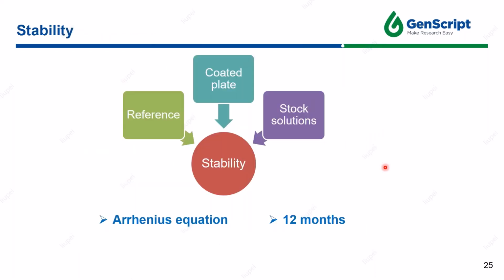Stability is the validation studies of determining the analyte stability after freeze and thaw cycles, and after short-term and long-term storage. All stability experiments should be performed on samples that have been stored for a time that is longer than the actual storage period.